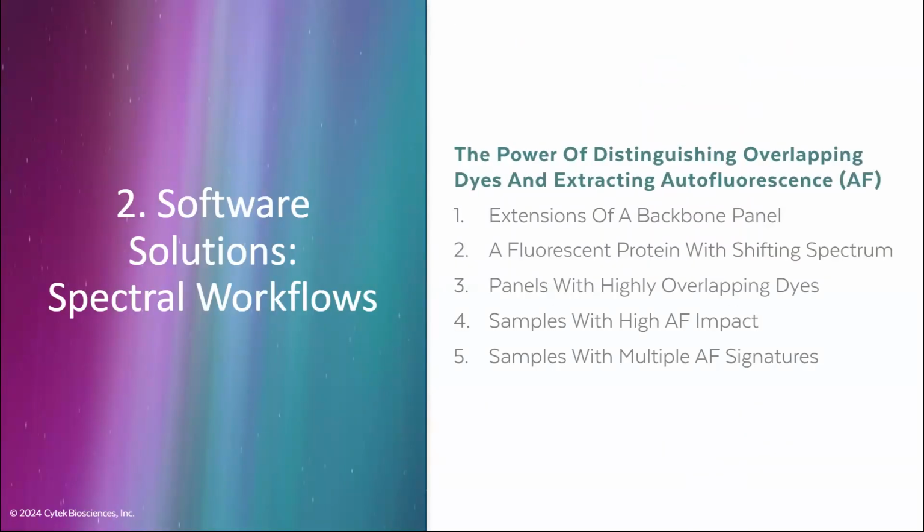We have discussed so far applications that are less complex, applications with 1 color, with 2 colors, with few colors that don't need all the information that spectral workflows provide you. But now, since if you want to make the decision later, if I want to go conventional or spectral, then you would do it based on your data, based on your application.